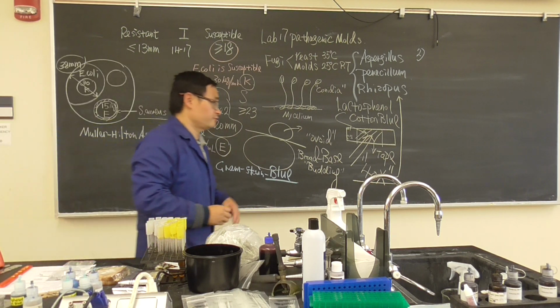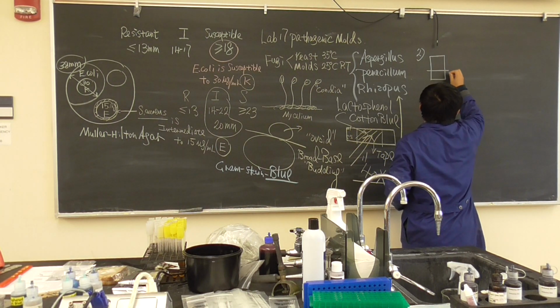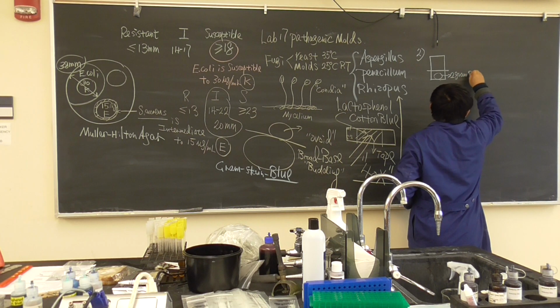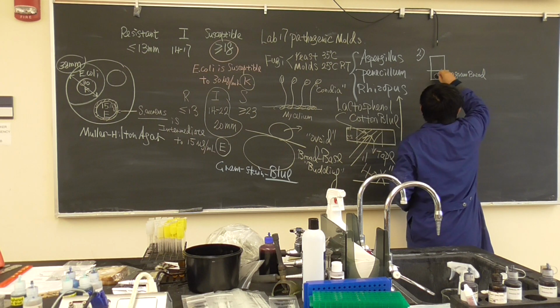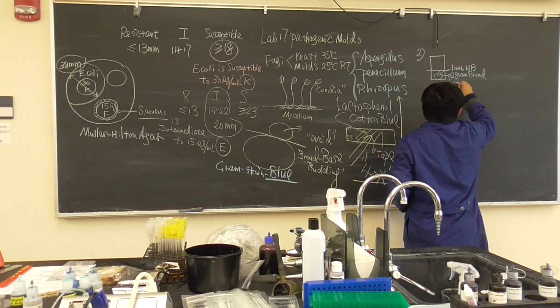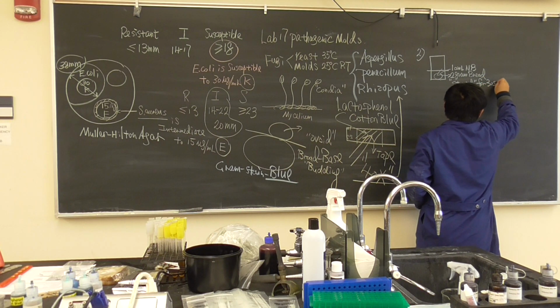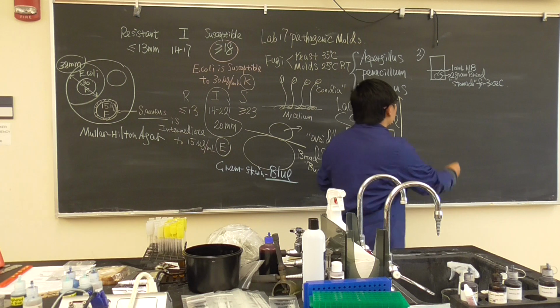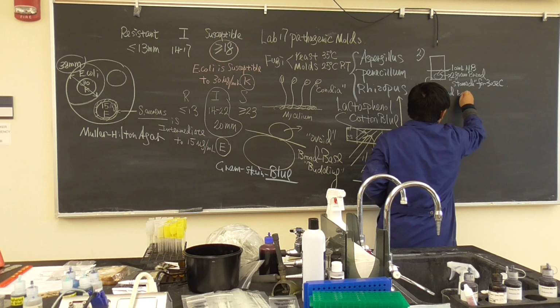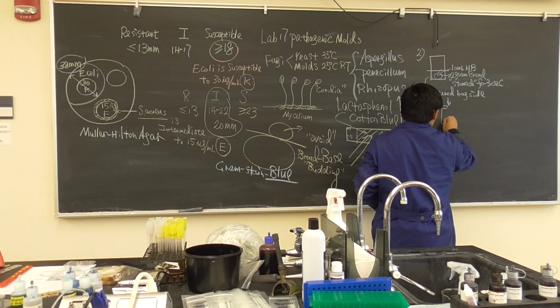Stomach about 15 to 30 seconds. So what we're going to do: in this filter bag, we're going to have 2 grams of bread. We're going to add 10 ml nutrient broth, and we're going to stomach for 30 seconds. And through this filtered side, we will do a serial dilution. I only need you to do two.